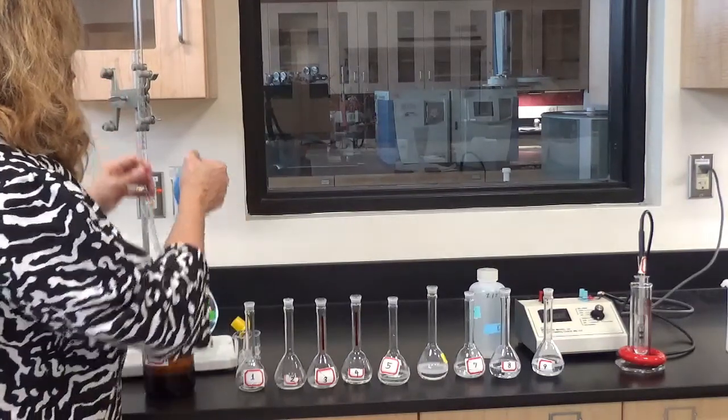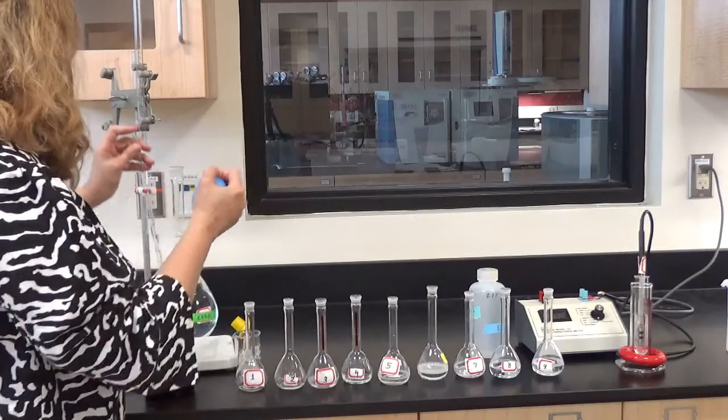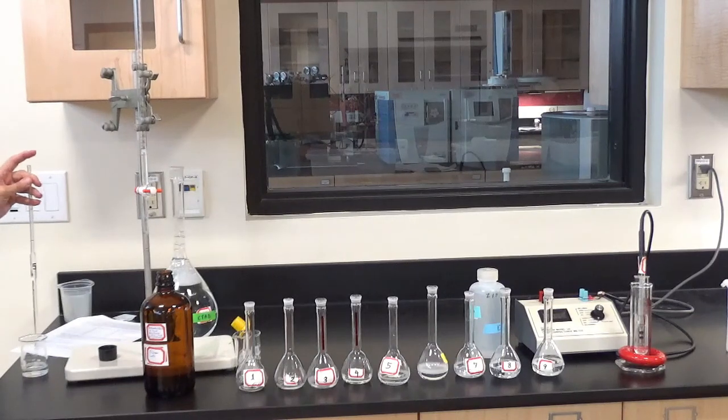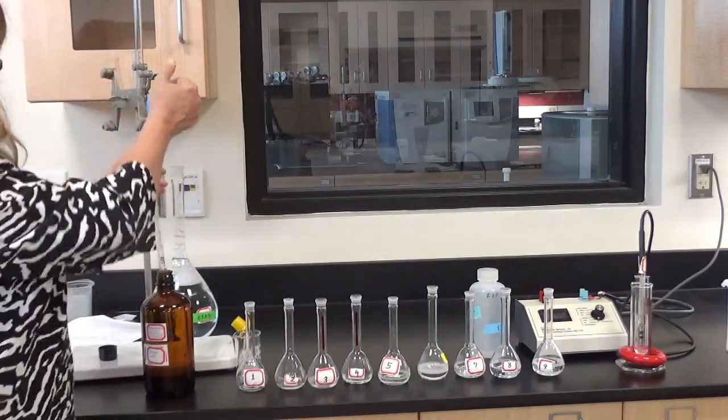Okay, rinse with this. Let's rinse the pipette. All right, so I'm just going to pipette 5 mils.